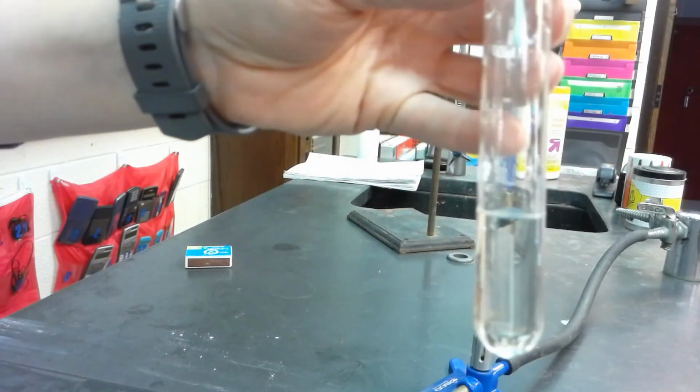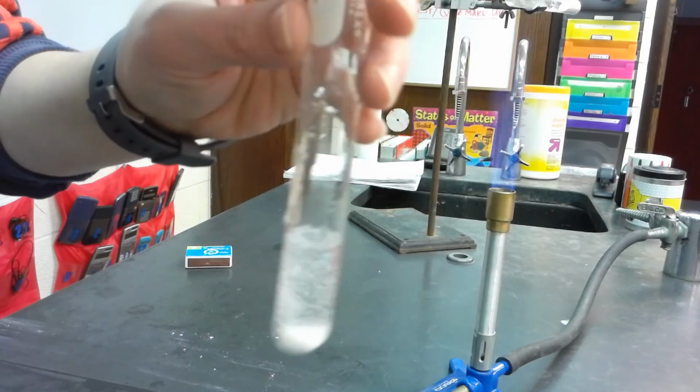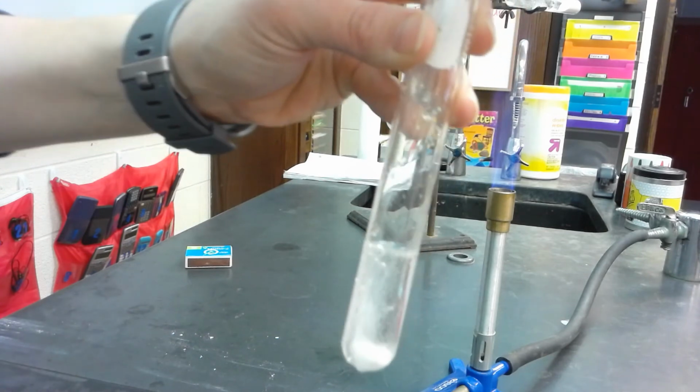Okay, so we're going to do the same thing we did last time. We've got the note card and the marble chip. Okay, it's going in. We're going to cover it with the note card.